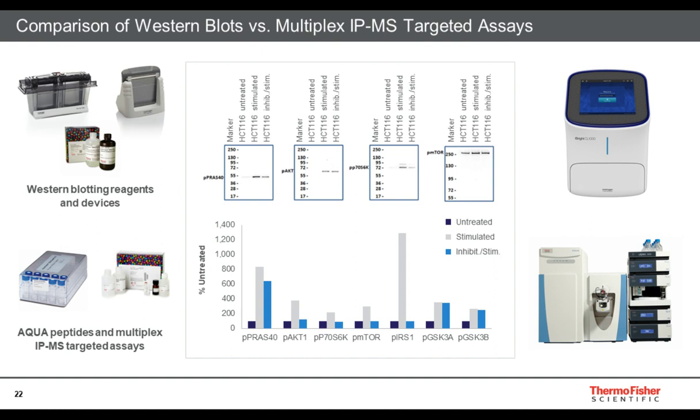So as I mentioned, we have developed these multiplex IP-MS assays for AKT, mTOR, as well as the RAS pathway targets.